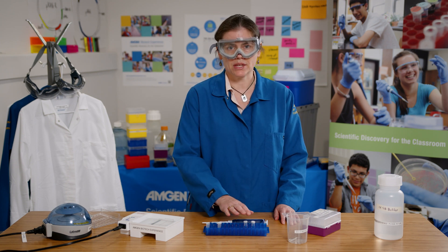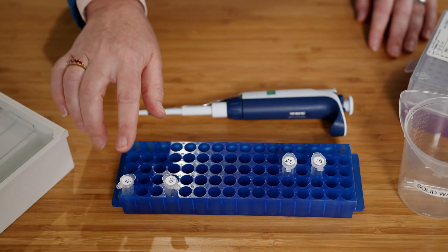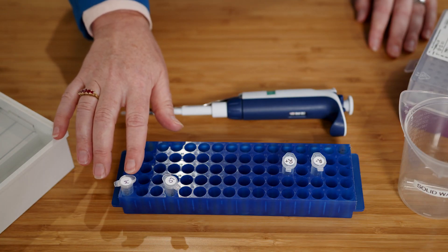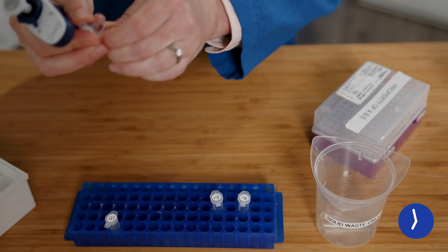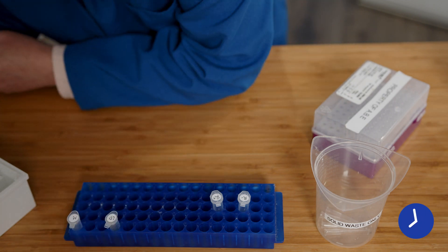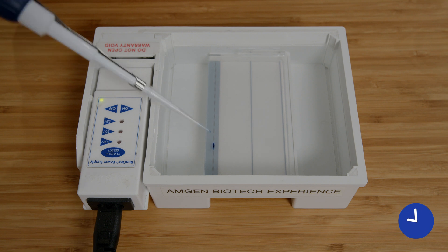Similar to lab 1.2, I'm going to add 10 microliters of each of my samples into different wells on the gel. I'm also going to add 10 microliters of DNA ladder to another well on the gel that I can use to measure against my samples. Remember when you load a gel, you need to keep your arms steady. Insert the tip under the buffer but just above the well and only press down on the plunger to the first stop.